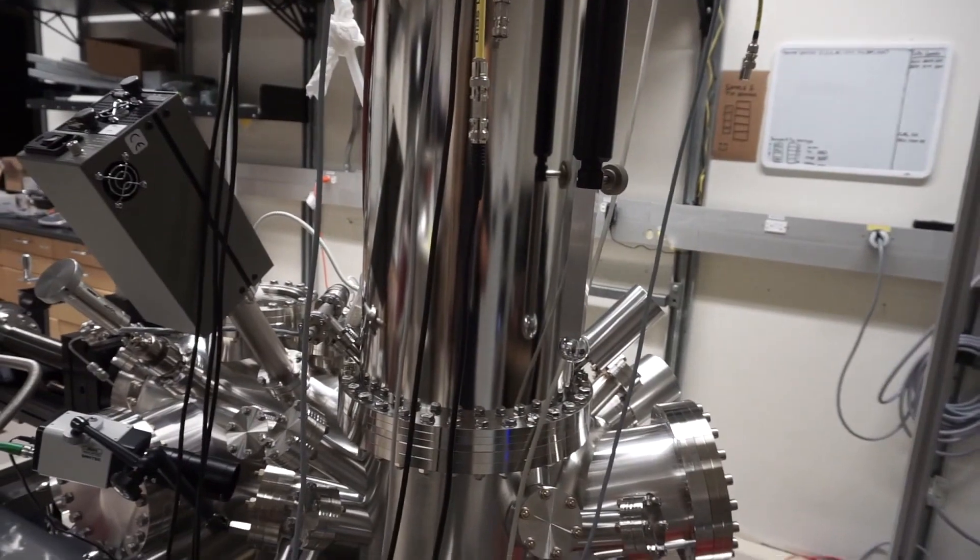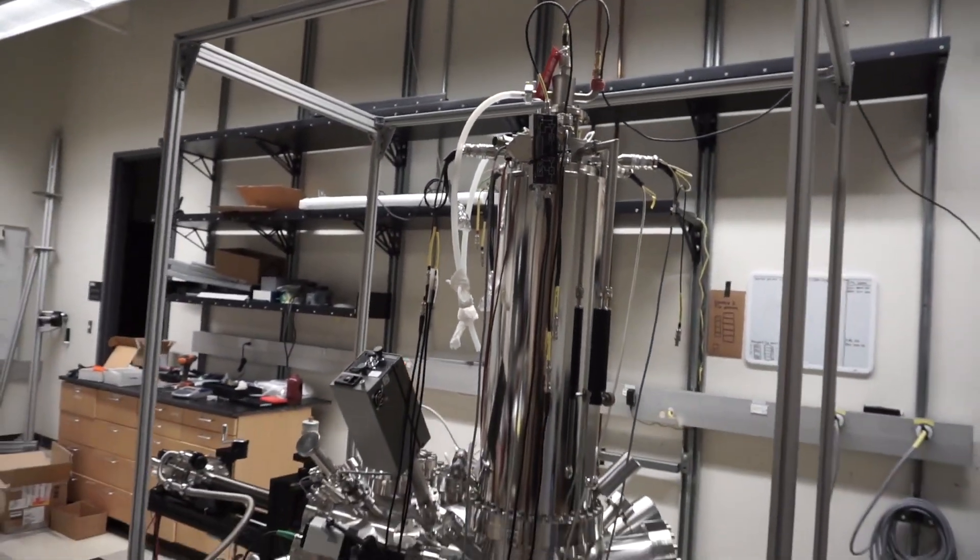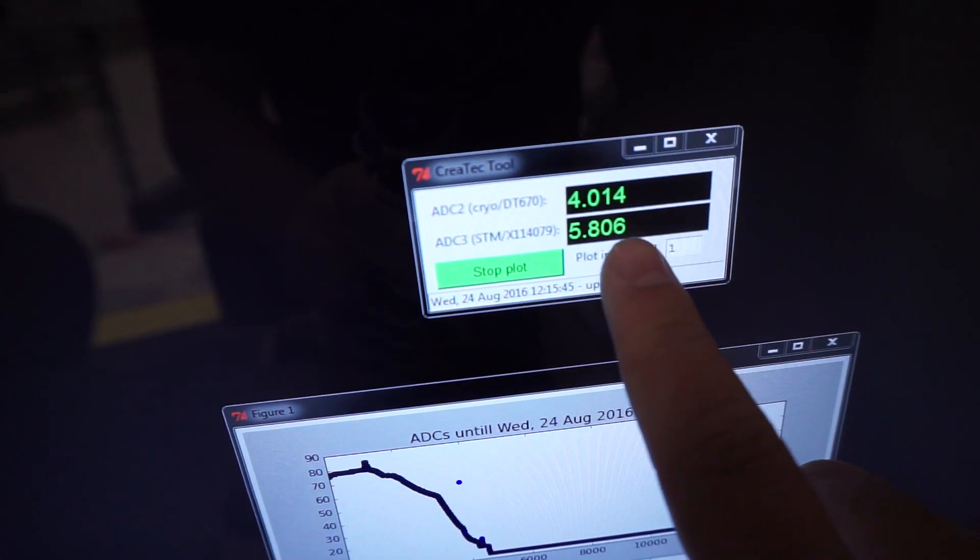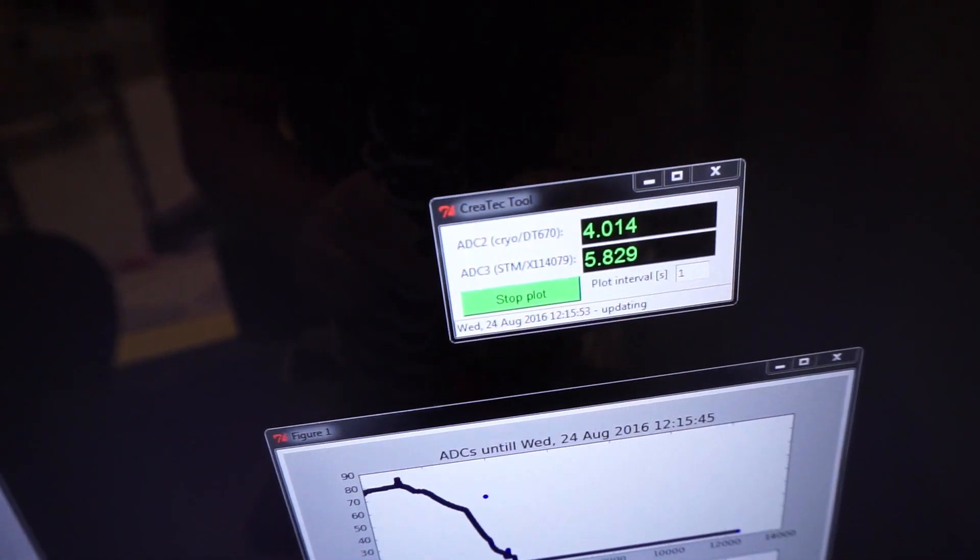We cooled down to liquid helium temperature last night. It's now cold. The STM is 5.8 Kelvin and the helium plate is at 4 Kelvin.